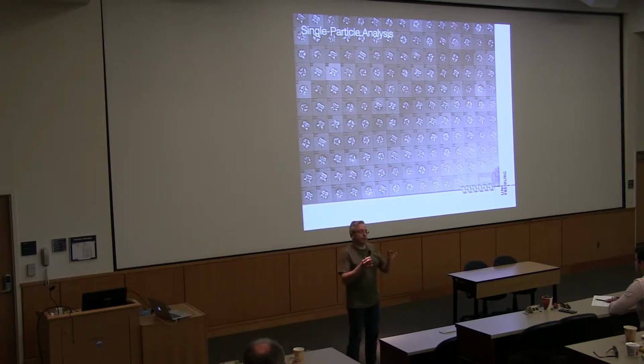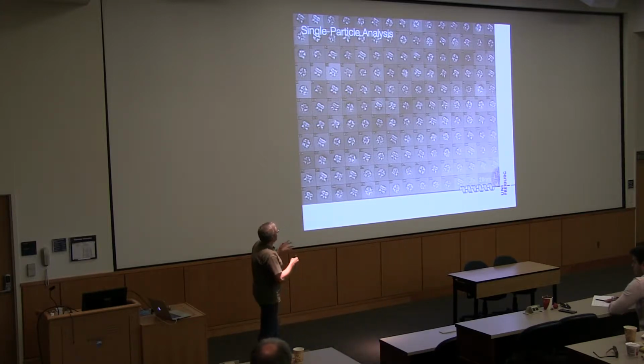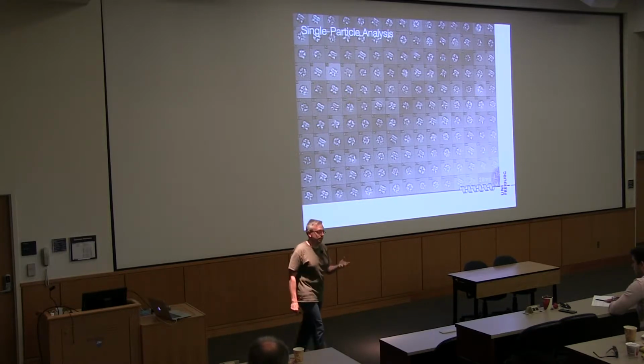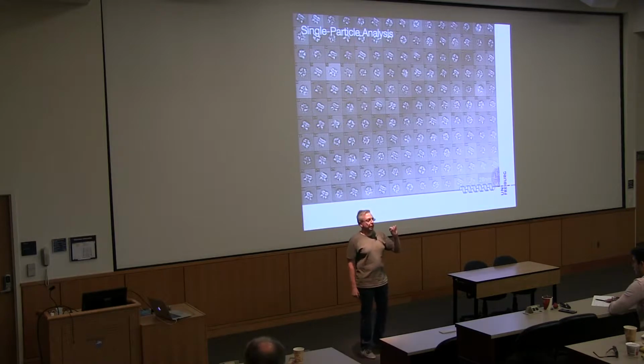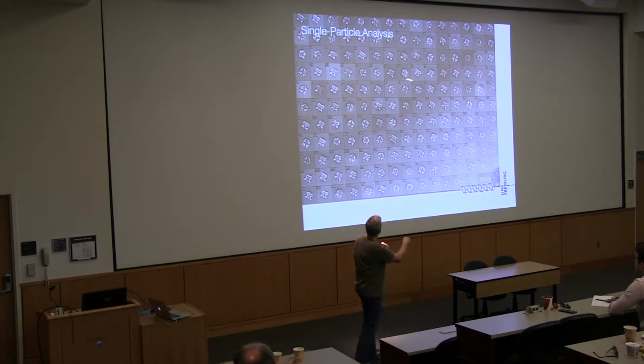So what you do is you need to do this very often. Everybody on the Death Star would agree. And then you try to see that all these are not the images you get from there. So the images you get from there basically just are a grayish pixely image with hardly any contrast. Then you go over those with a computer and you try to identify individual particles that are in the same orientation. And then they're called classes. You average all the individual observations in a class where the molecules have the same orientation, and then you generate class averages that represent different views of such an object.